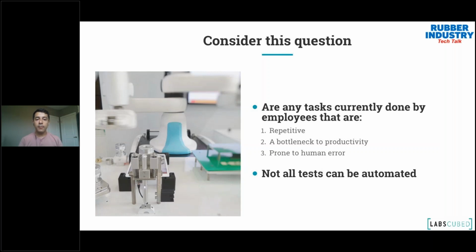Now, it might be that it's prohibitive, it's too expensive to automate. There's a whole bunch of different reasons not to do it, but it's still important to start looking out there and seeing what's out there, because one day someone comes along and creates something innovative that solves your problem. So I think that's the main question that I always ask people. The other thing I want to say is not all tests can be automated. I've been in labs where there are tests that are really technician driven, require a lot of knowledge, and are very difficult to automate. In those cases, those might be something really for the future, but that's the main question that I ask when I talk about automation with customers in terms of hardware itself.